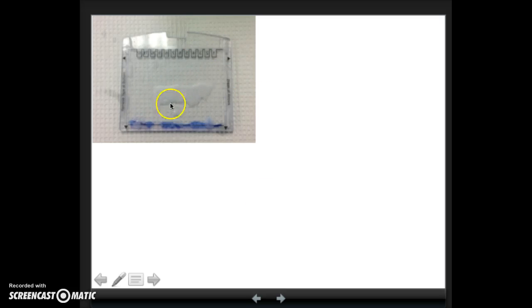Here is the gel after we've run. Notice there's this blue line at the bottom, and that's what we call our tracking dye. That's Bromphenol Blue. It basically helps us figure out how long to run the gel. We don't want to start running proteins off the bottom. So you run the gel until the tracking dye forms a line near the bottom.